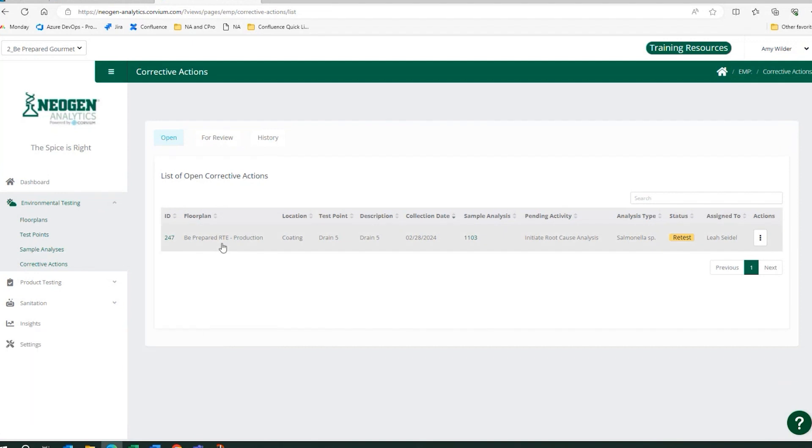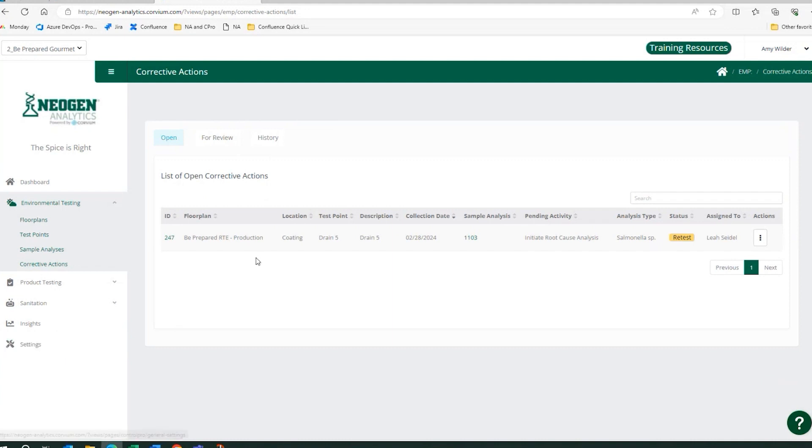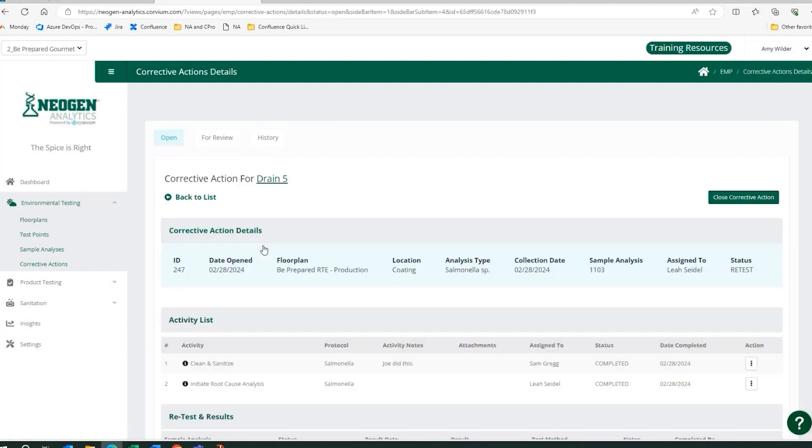And this corrective action is triggered, again, based upon what you've configured in settings. So if it's a Listeria failure, it knows exactly what activities, retests, things like that need to be completed.